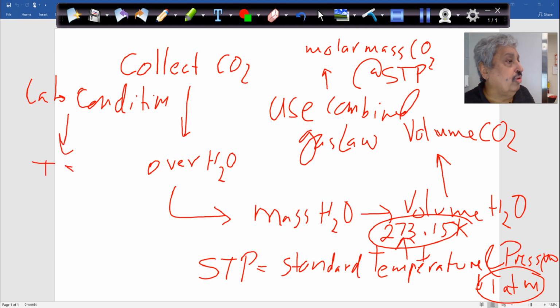Just take a thermometer from the drawer, put it on the bench, and measure the temperature. And the pressure, I have to locate the manometer, I don't see any manometer, but it's close to one. We are very close to Savannah sea level. So at Savannah sea level we have 1 ATM, but this is close enough. So this temperature here will be, as it says inside the procedure, around 21 degrees Celsius.